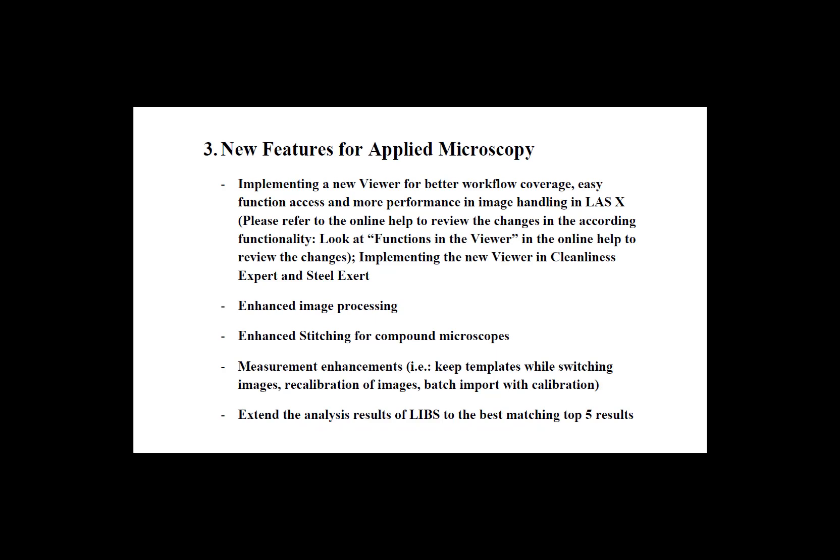Next up we have a number of changes and improvements to the software. First we have a refresh to the UI designed for easier workflows and better performance with image handling. I'll cover these UI changes in depth shortly. Two, enhanced image processing and stitching for compound microscopes. Three, enhancements to our measurement tool. And finally our LIBS customers have extensions to our top matches.